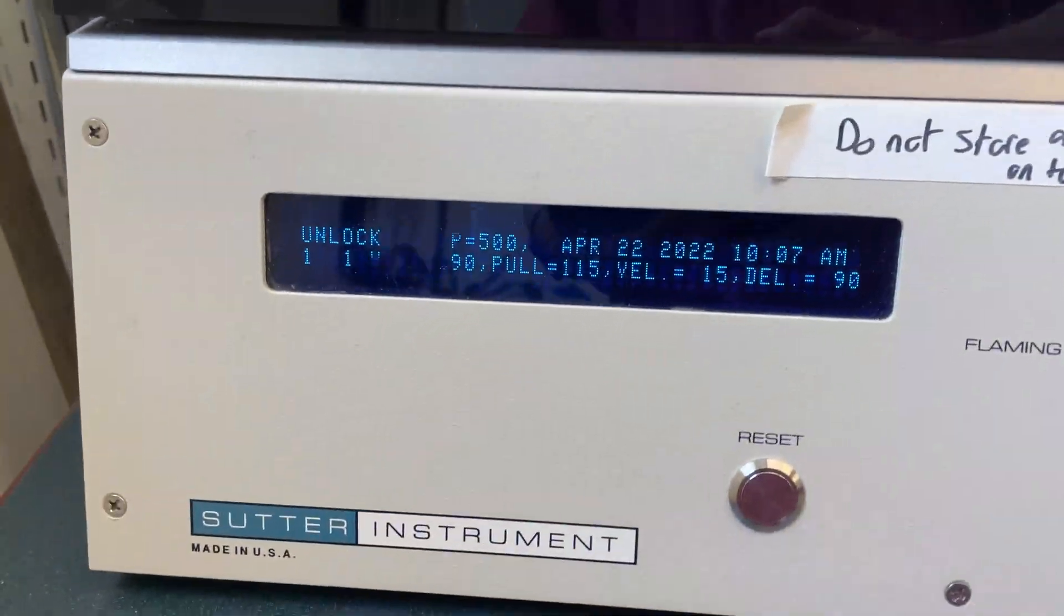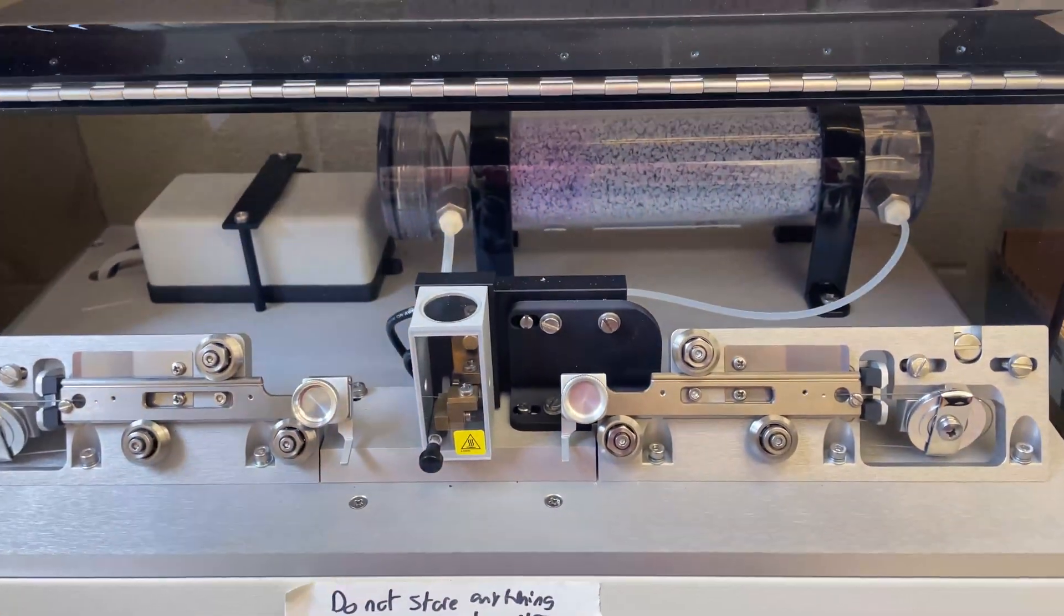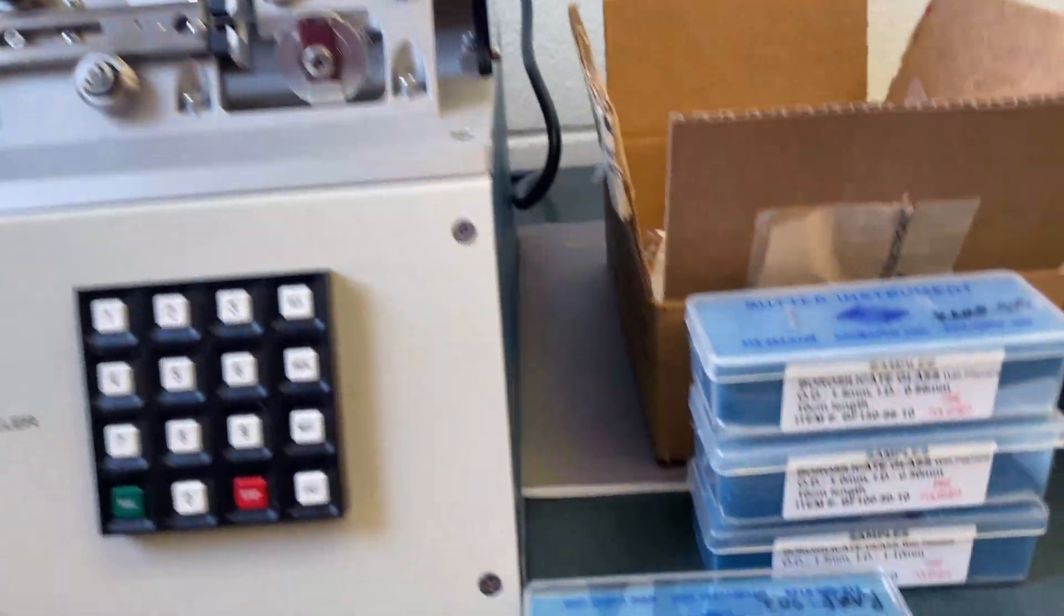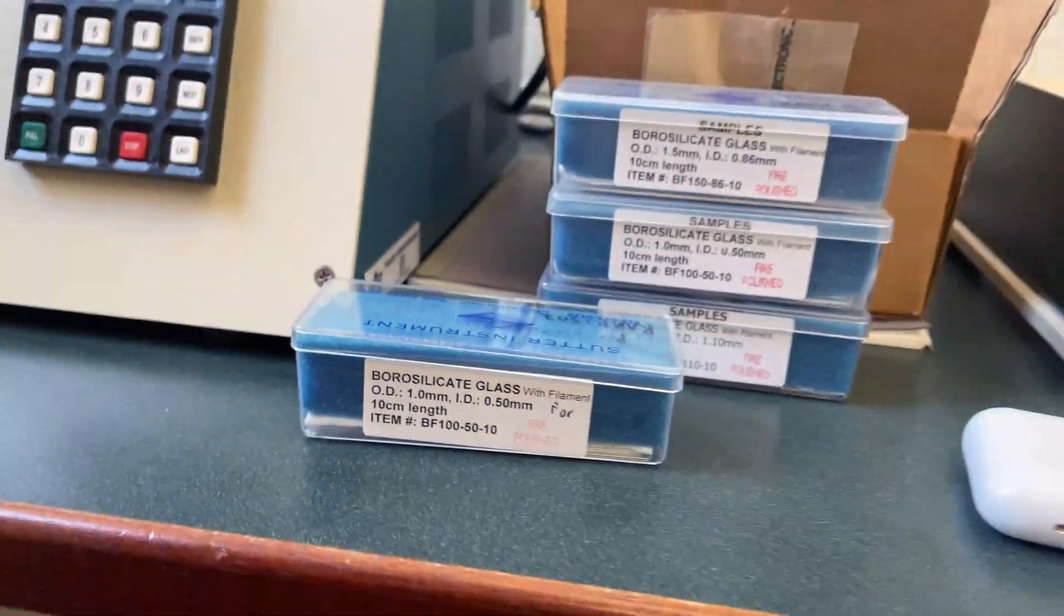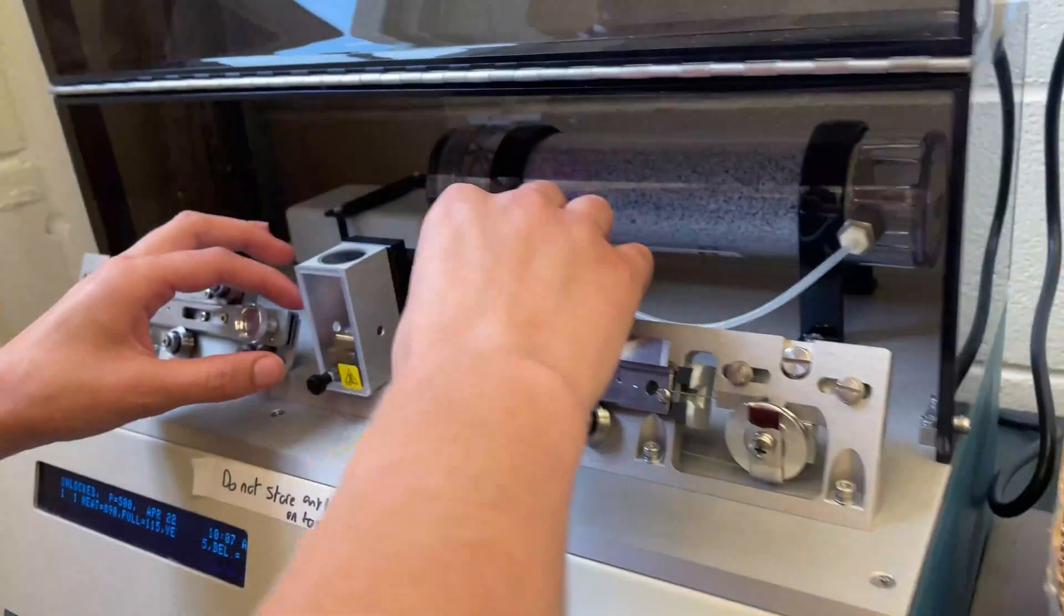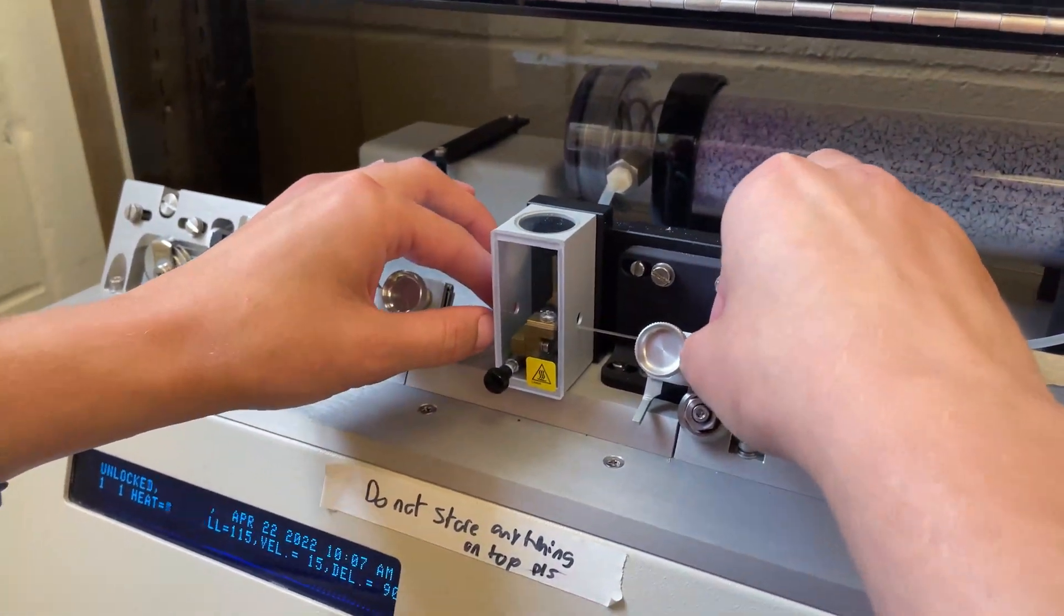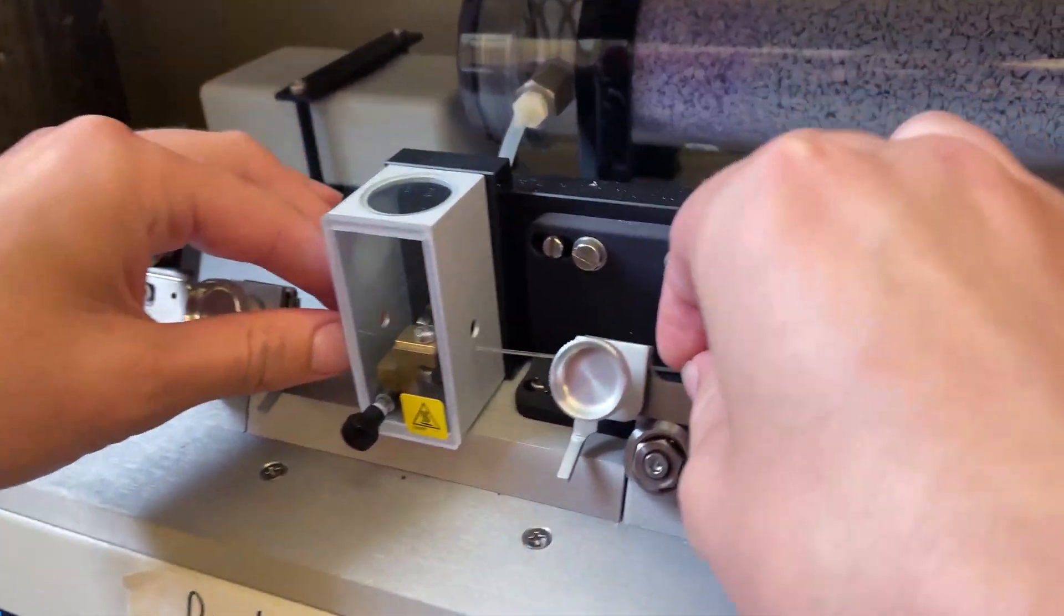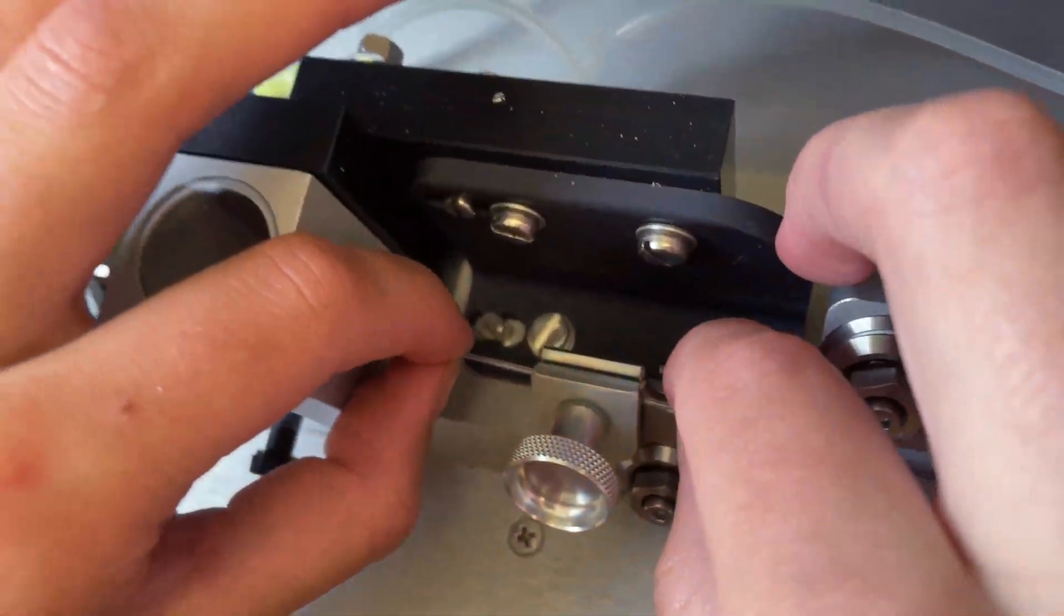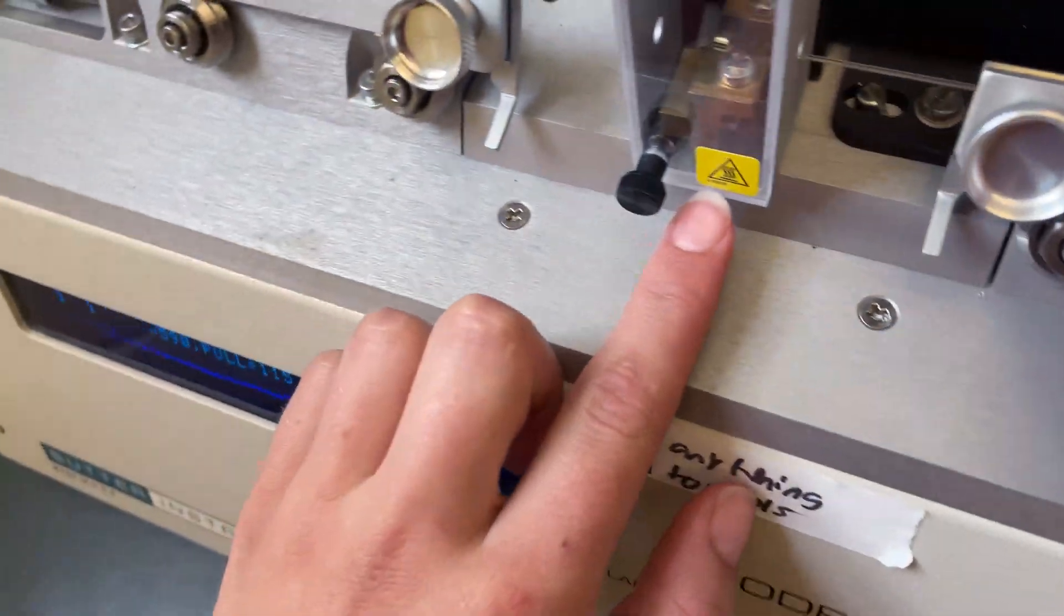Now it's got it set. I open it up and we are going to use needle size 1.0 millimeters. This goes through this metal piece. We might have to get a little closer, so we are going to go here to the side.